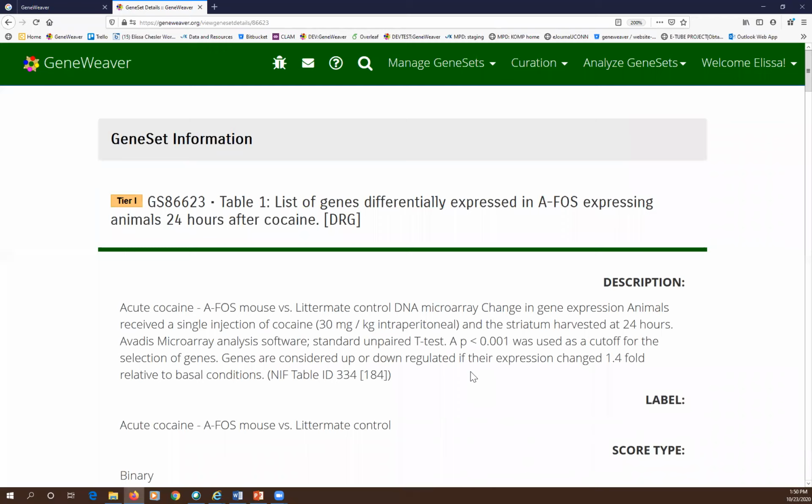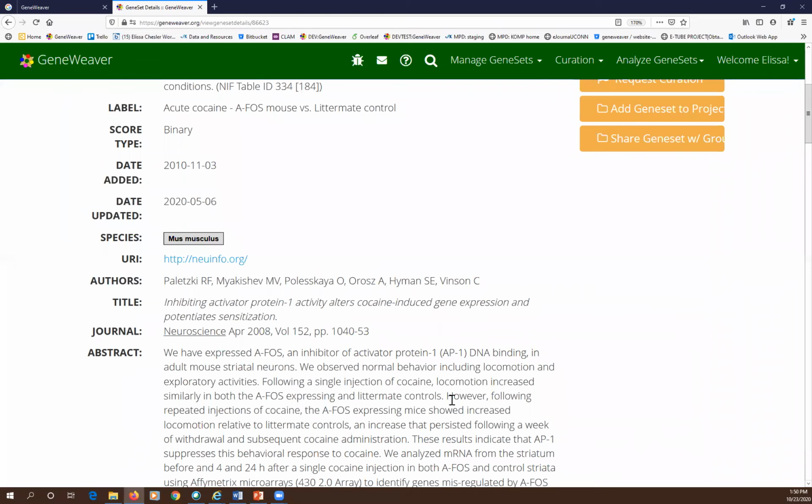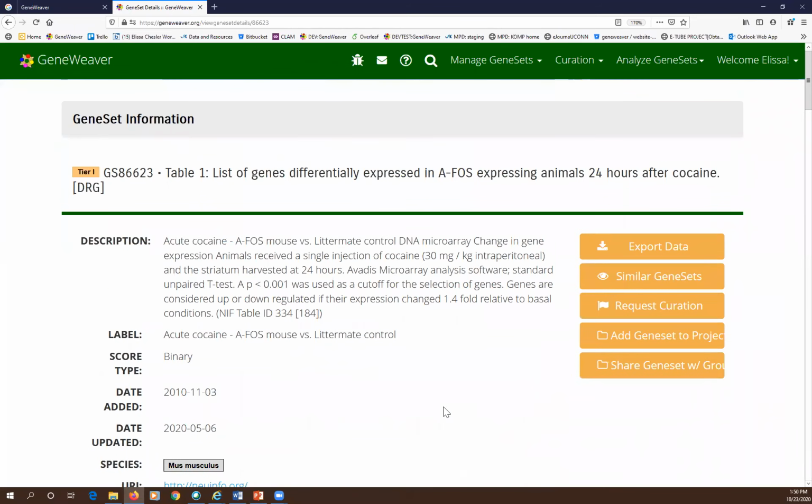And I'll select that gene list. I'm going to just zoom out a little bit just so that we can see some of the basic buttons and functions. Still legible? Yes. So I can find gene sets that are similar to this one quite rapidly, but I'll let it go. It's going to run. It'll take a minute.